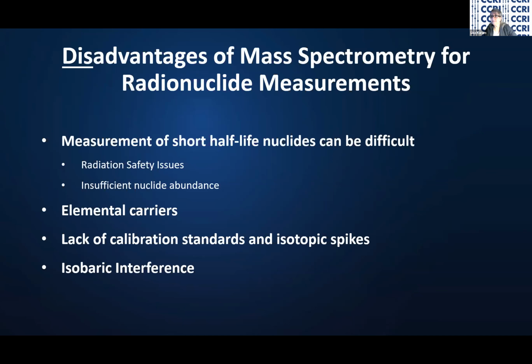Young-Suk, you have your hand up? Yes, I also wanted to mention one thing about the relation between these two areas. I think that we need some intercalibrations between measurements in the radiation field and the amount of substance field or the mass field, to see whether the data can really be comparable.